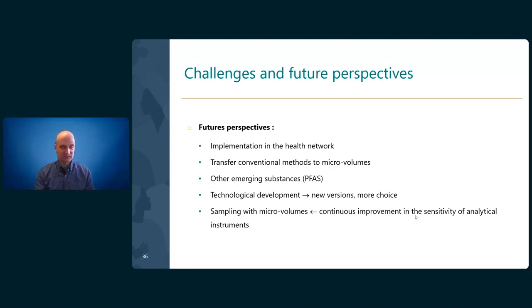On our side, and I suppose it's the case for other laboratories, we might need to transfer conventional methods to microvolumes. Historically, all our methods here at the Cirtiu have been based on conventional volumes, so thousands of microliters or milliliters of samples. But now it's possible to go to microvolumes.